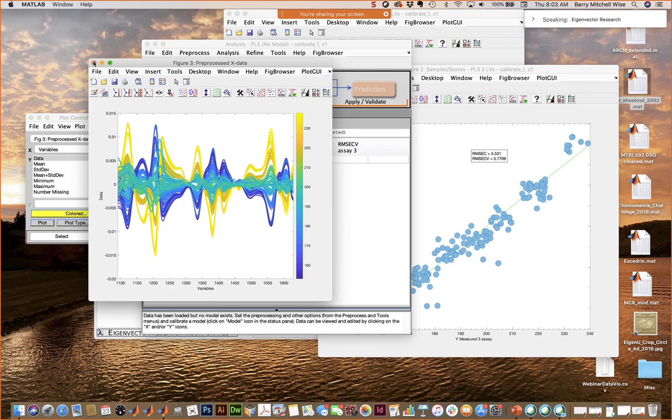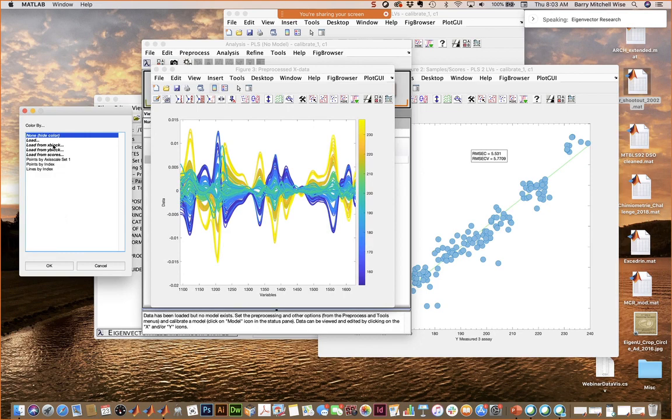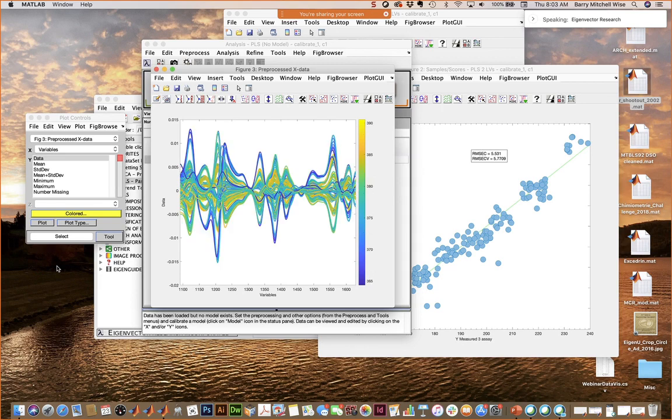Well, you can color this by any of those. In fact, here I could choose to model assay value instead, or weight, if I wanted to model weight. And I can see how it looks on that. Another trick that we do, which doesn't look like it has a lot to do with weight there, maybe just a little bit.